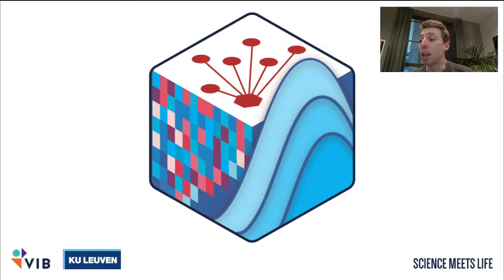Then there was a question how to generate the cell type annotation data frame. Most of the time, if you have multiome data, this comes from the single cell RNA-seq analysis, where you can annotate the cell types based on known marker genes. If you don't have single cell RNA sequencing data, this annotation comes from something else.